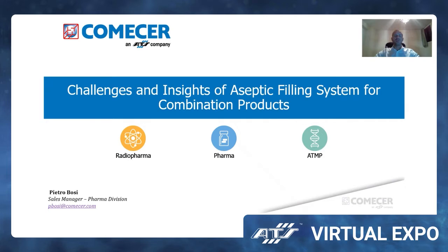I'm glad today to welcome you to the ATS Virtual Expo, and I'm going to talk today about challenges and insight of aseptic filling system for combination product. This is definitely a new topic that is gaining growing interest in the pharmaceutical field, since it's representing a new trend of drug delivery, providing an enhanced quality of the medication and a better safety for patients.